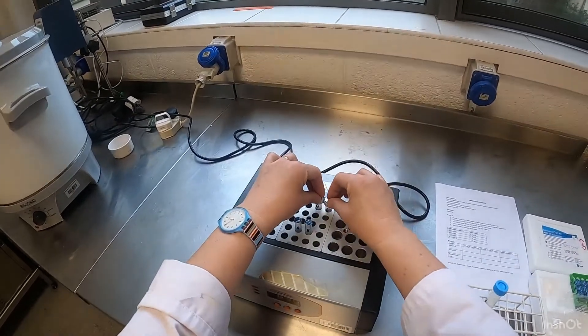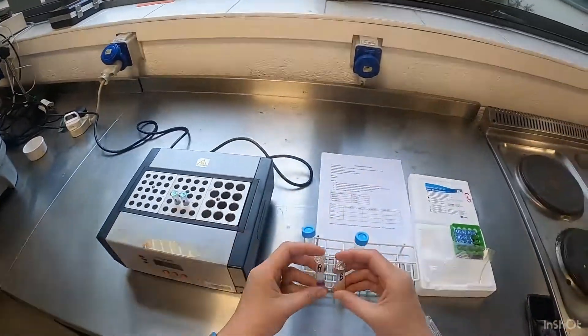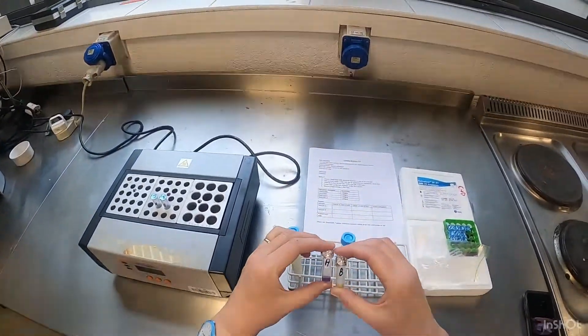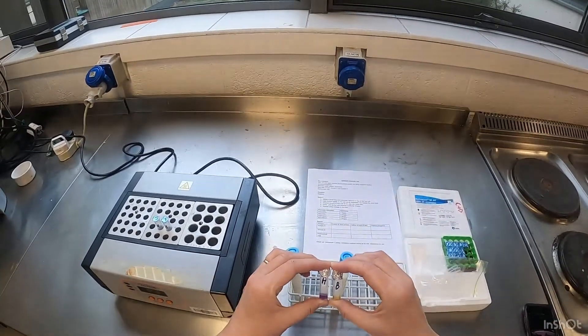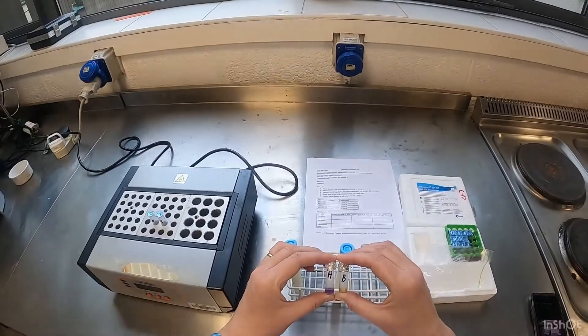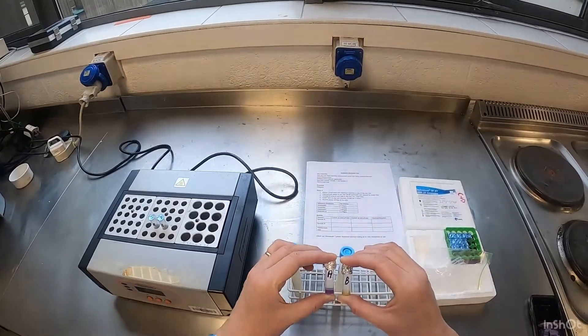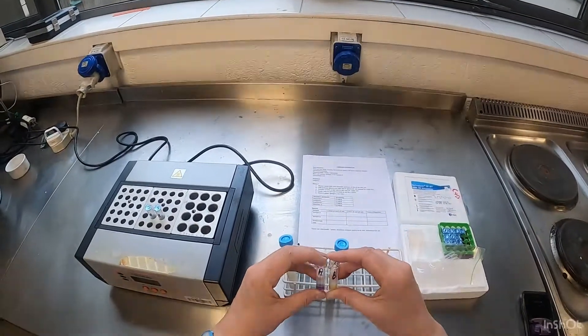Two samples I had previously prepared. You can see we have sample A and sample B. Sample A has remained purple and sample B has turned a yellow colour. I'll put together a worksheet and you can have a look to see which one of these is positive and which one of these is negative for antibiotics.